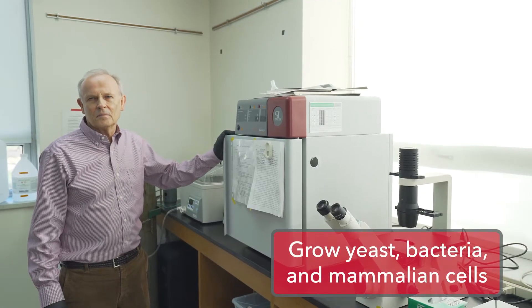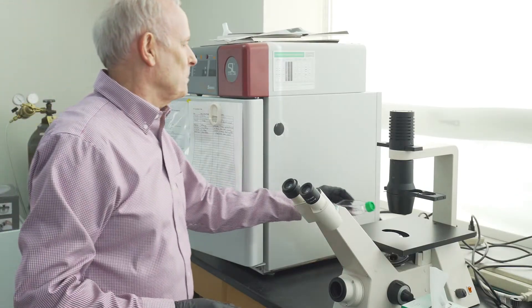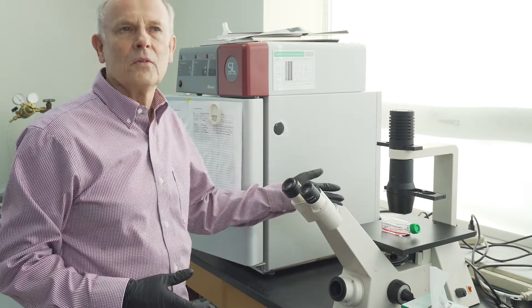Once we've inoculated our mammalian cultures we bring them over here and put them in this incubator, and to look at them we put them under an inverted phase contrast microscope where we can view the progress.